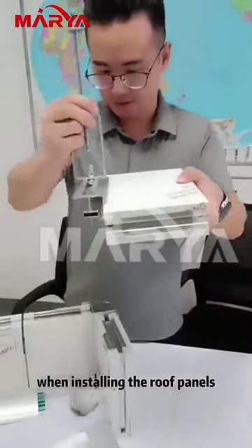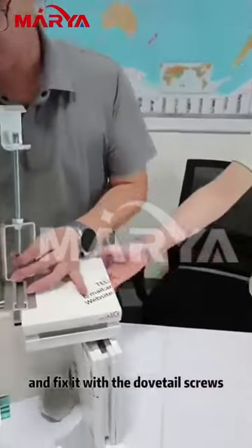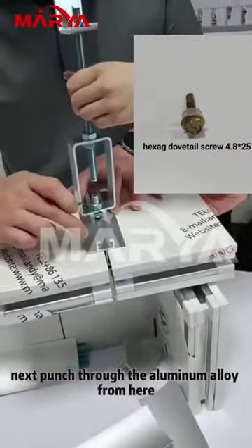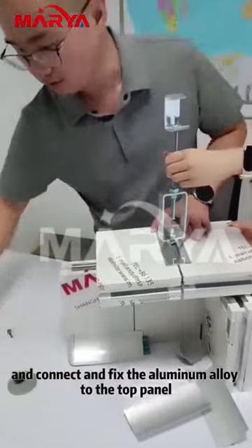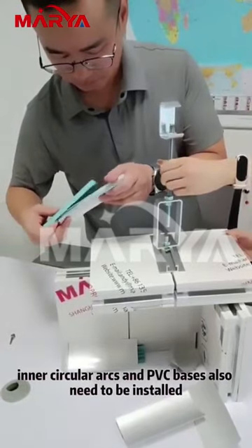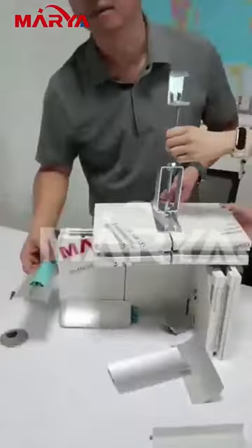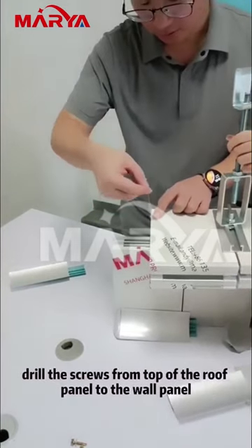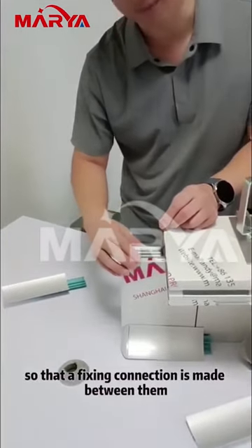When installing the roof panels, snap the roof panels in from the side of the suspension beam and fix them with dovetail screws after they are firmly clamped. Next, punch through the aluminum alloy here and connect and fix the aluminum alloy to the top plate. Inner circular arcs and PVC bases also need to be installed above the connection part between the wall panels and the roof panels. Drill the screws from the top of the roof panel down to the wall panel so that a fixing connection is made between them.